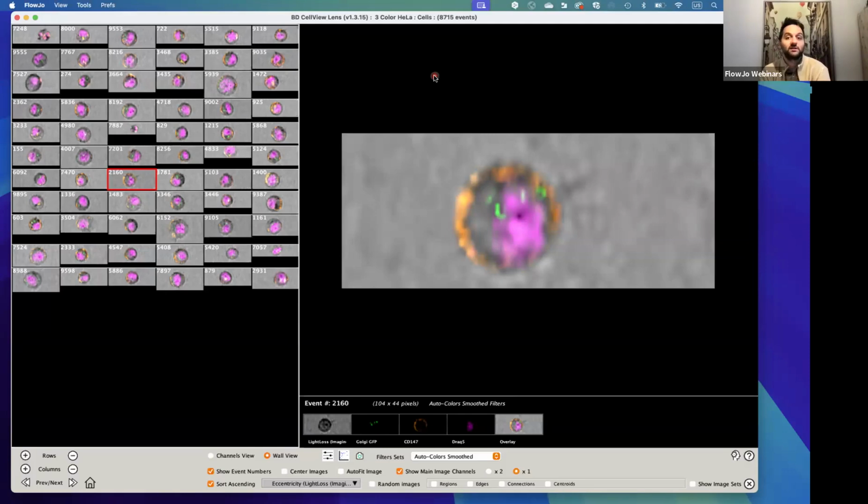If you are seeing larger cells or stimulated cells change morphology, it might be diffusivity or other parameters play a role. It's really not an easy question to answer, but I think it will always depend on the samples and types of samples you have. Okay. Maybe I'll show you some insight on how you can find those.